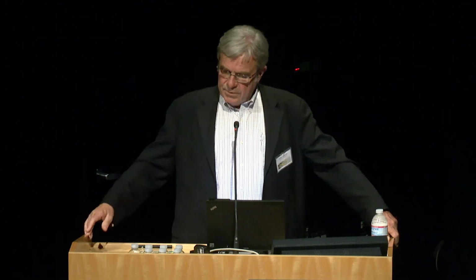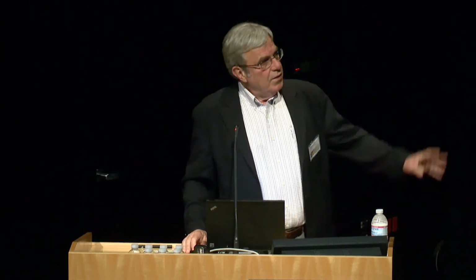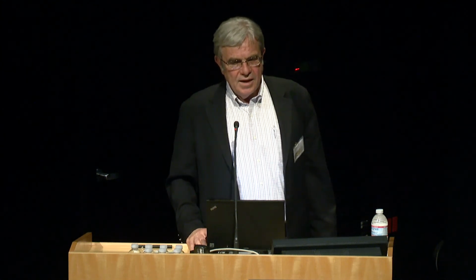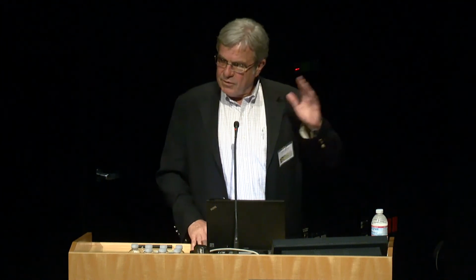So we wrote the program, as I said, last year, thinking to the future. We can do 24 electrodes, not several thousand, but we're ready for that. So no, it's just that we're not engineers, so we're not really good at putting all this together. I do see problems on adding those ionophoretic barrels to this, but I count on my engineering friends to figure out how to get that particular part done.